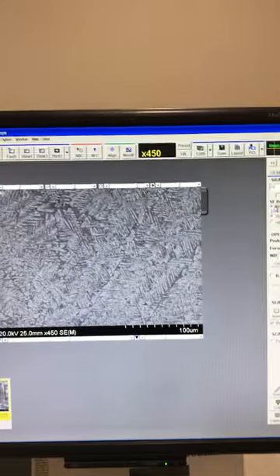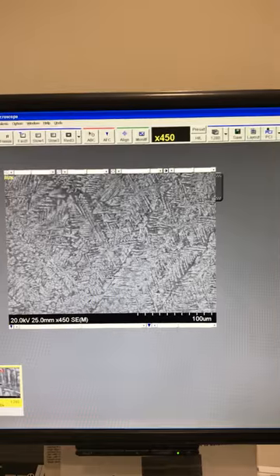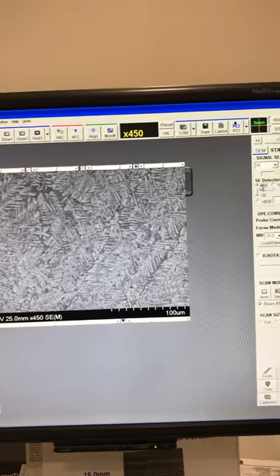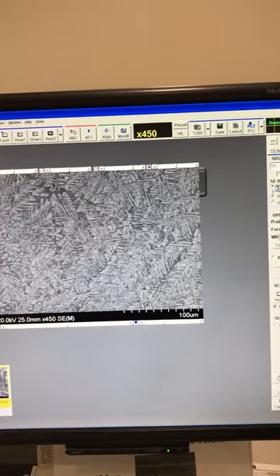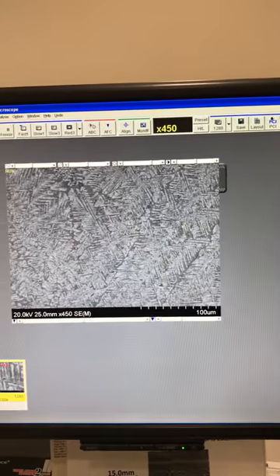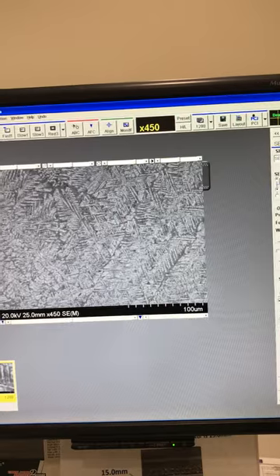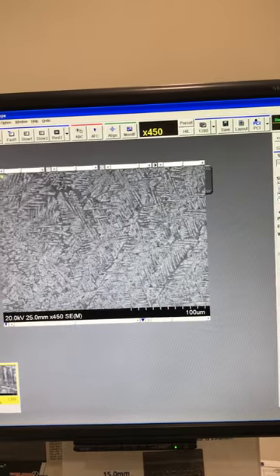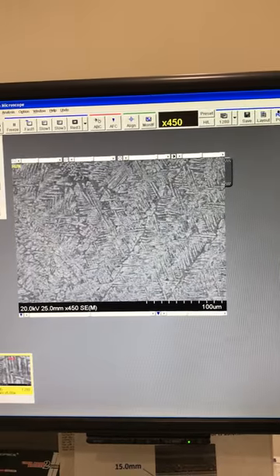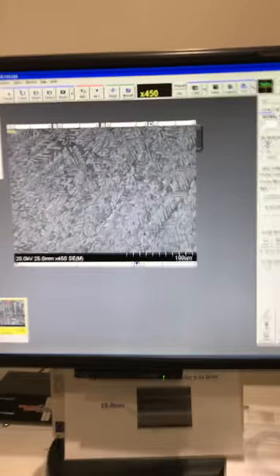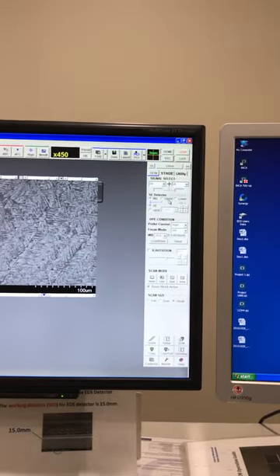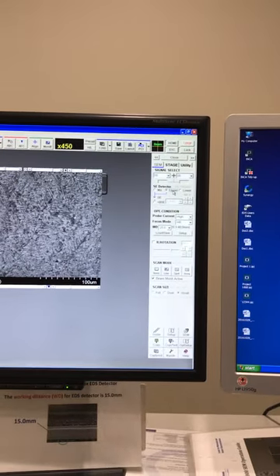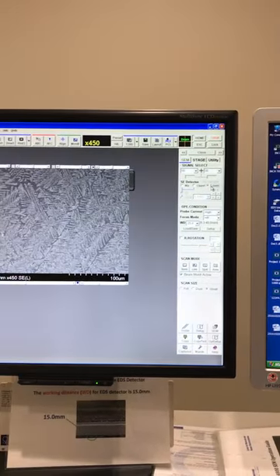But consider this. If you have a non-flat surface or if you have a problem with your image, mixing two different images with two different qualities makes the mix image look worse. That's why you check always your upper and your lower detectors.